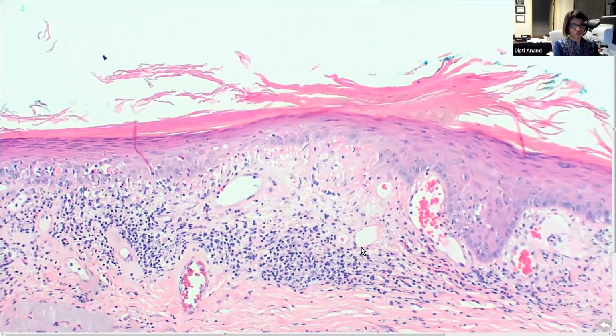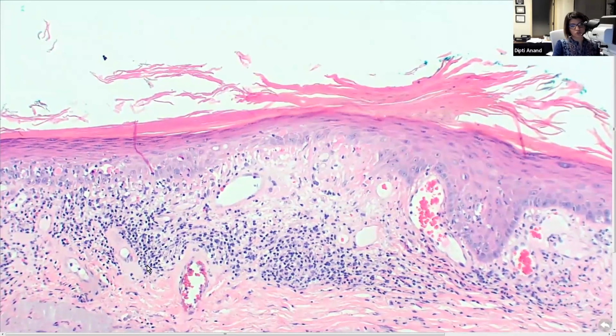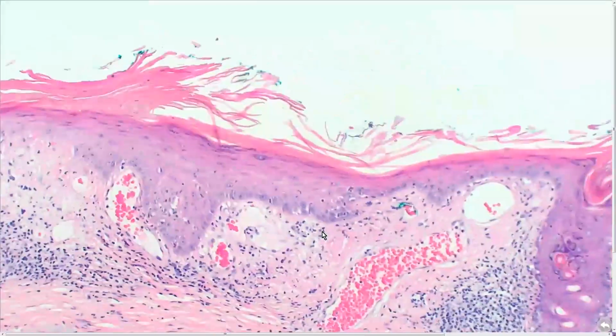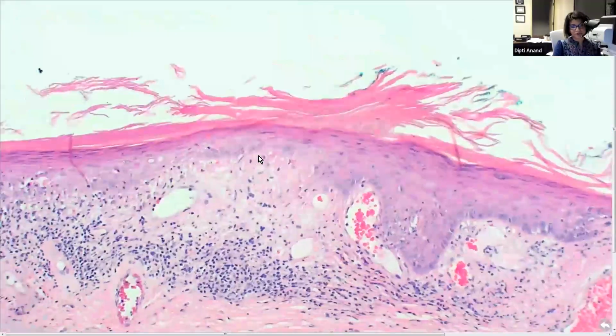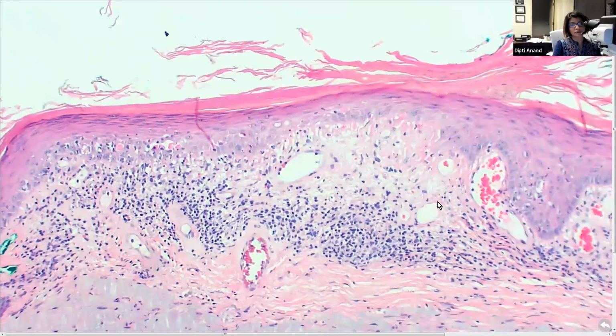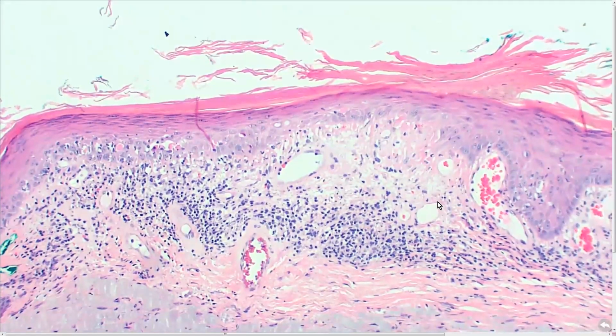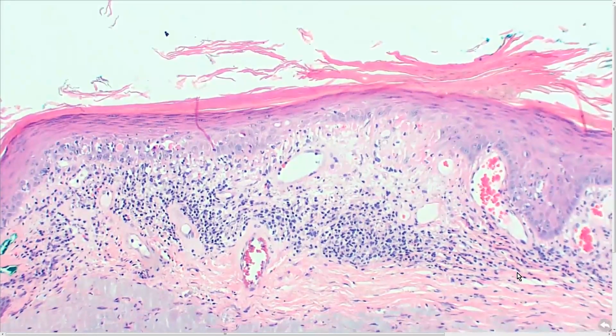If you can recognize a reaction pattern, you know the disease. I see a lot of dilated vessels. Yes, but does the epidermis look normal? No, it looks like there's some squamatization of the basal layer. Yep. And there is atrophy and it's got to be interface change. PLEVA. Okay, so you said squamatization and then you are saying PLEVA. What does squamatization mean? Chronic lichenoid. Chronic. So is PLEVA chronic? No, it's acute.